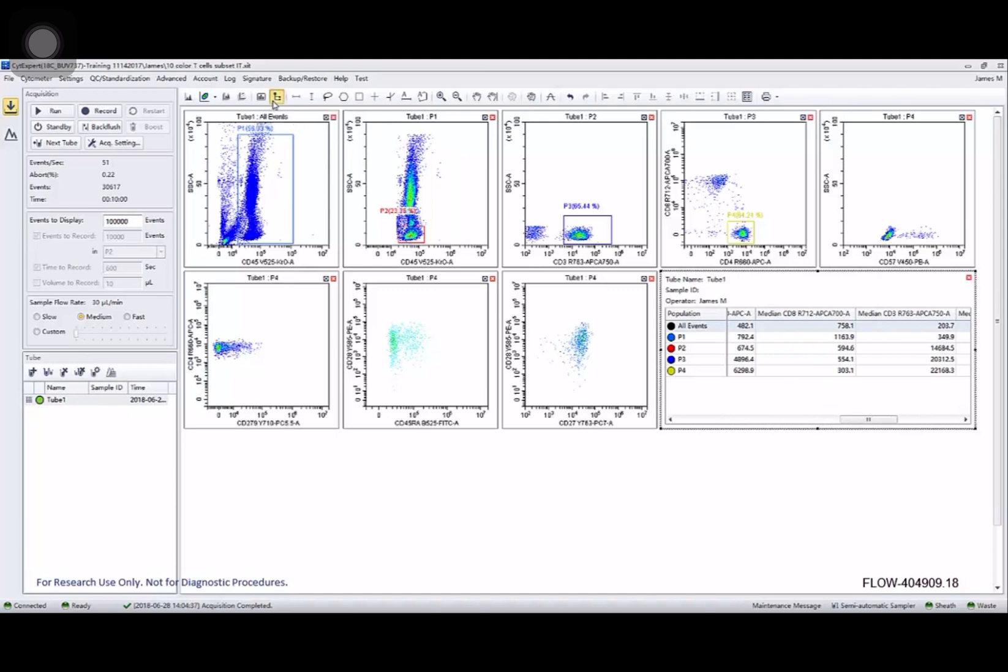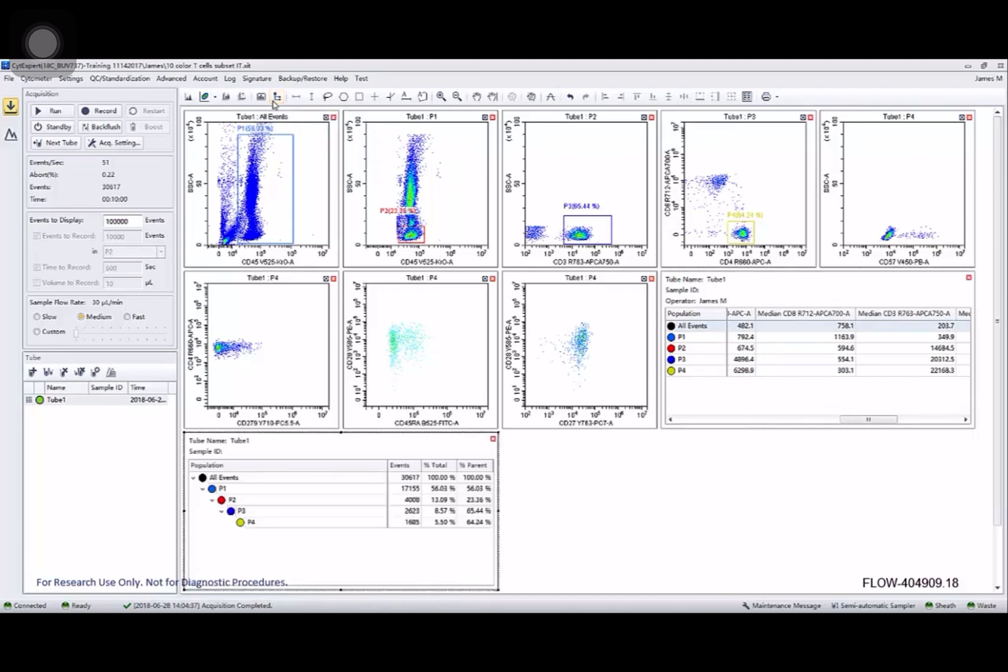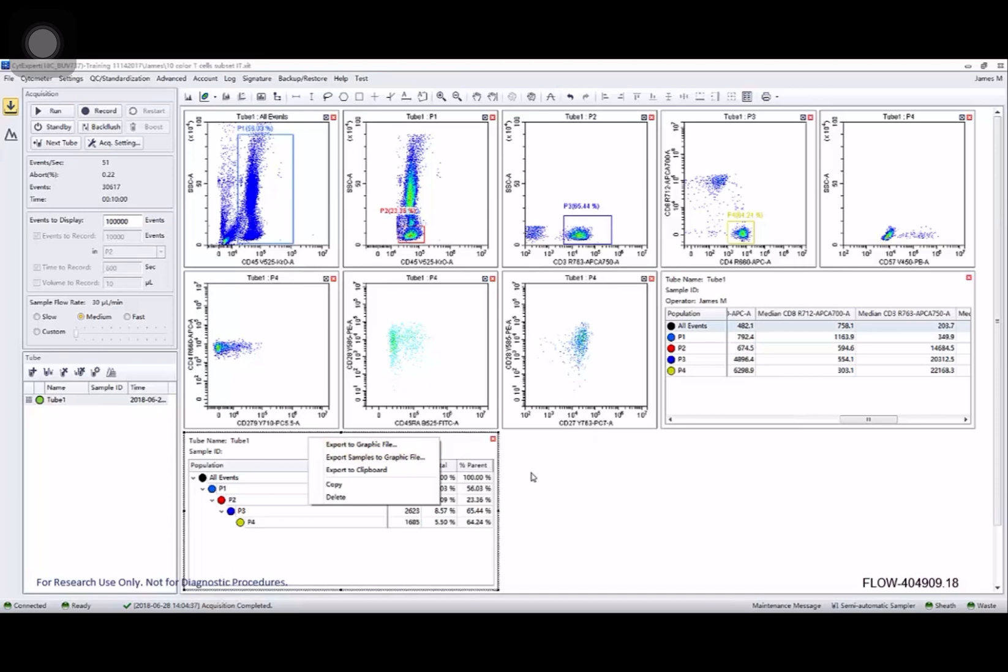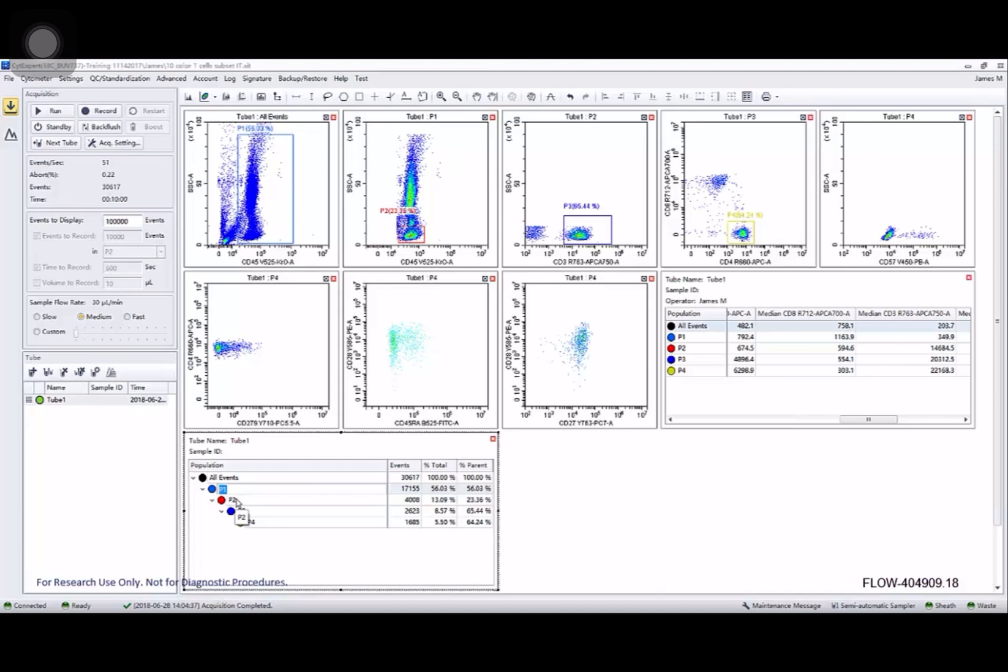If I want to look at the hierarchy of my populations, I can click on the hierarchy button. I can export that to a couple of different formats. And this is another place I can go in if I wish and select my region names and modify them to something that makes more sense than P1 through P4. Name that one white blood cells.